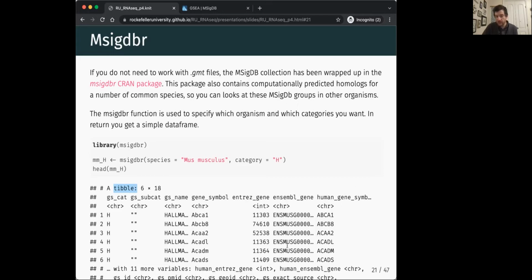And so it's really nice because it has all this information that applies regardless of what your data set's in. So maybe I did all my analysis and I was using Ensembl genes. Or hey, this has the conversion and it will tell you which gene sets they belong to. Yeah, so this is a really nice resource for this.